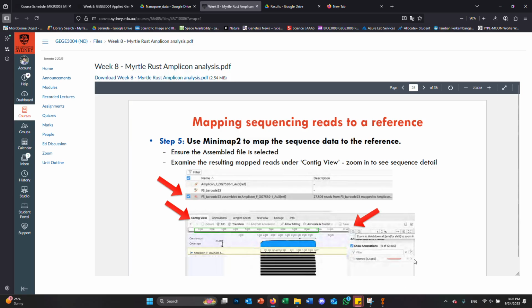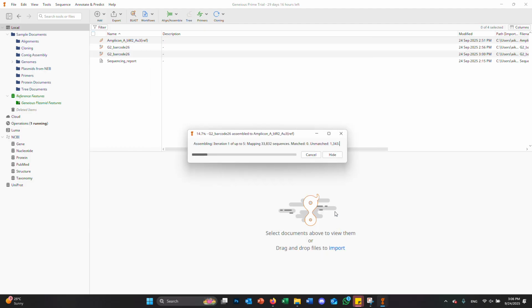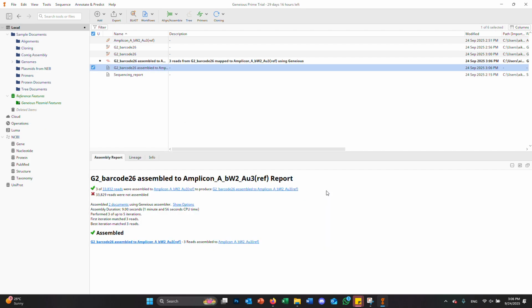I'm not sure what your defaults come up with. Is it similar to what I've got here, 60% highest quality? You can, yeah. The gap. I don't think it changes anything for the trimming, but we can try that. But yeah, the main thing is the threshold. We'll just keep it at the highest quality for now, but I will make a note here.